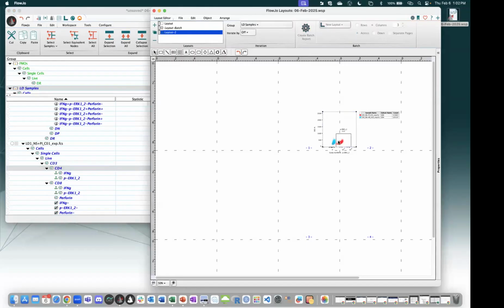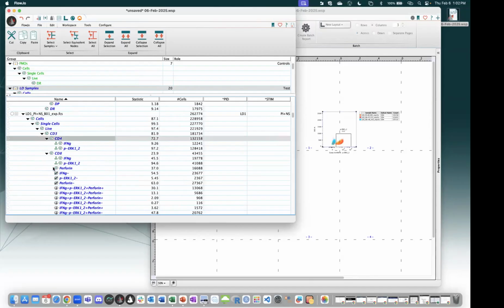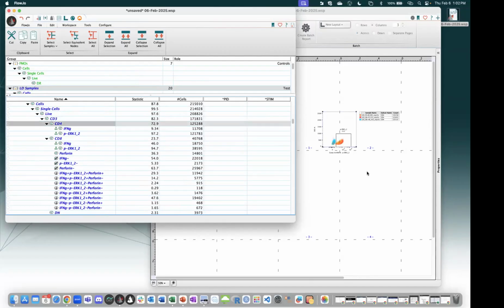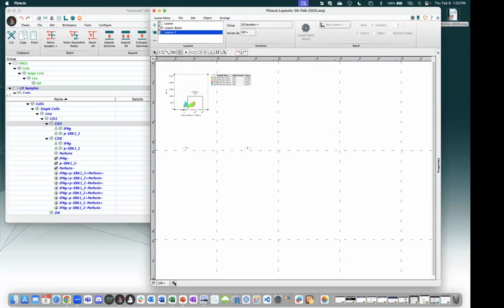That means I'm going to overlay those 2 conditions. Same thing for my third condition. And the double stimulated condition, we're just going to put on a miss. Don't worry, you can always click and drag back on top of it. And there you go, the overlay.